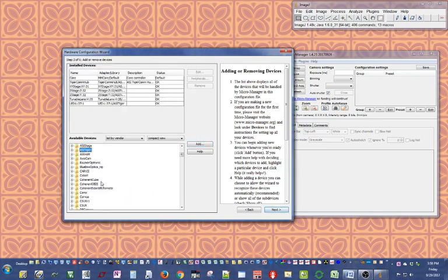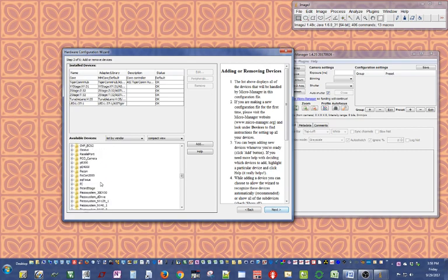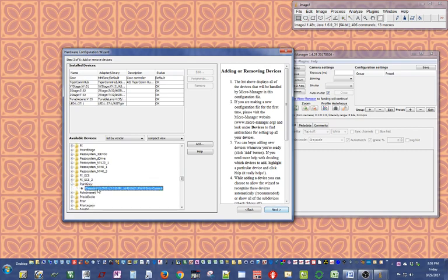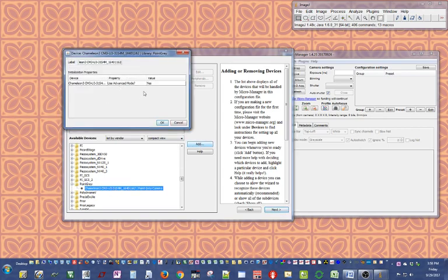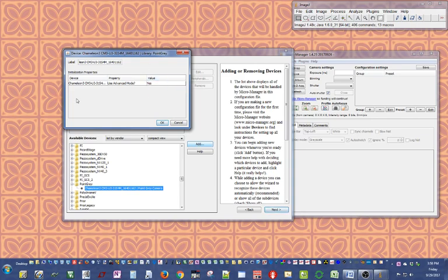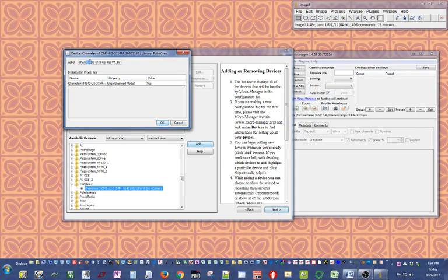Next I need a camera. Like I mentioned before, I have a Point Grey camera. Scroll down here to find Point Grey. Chameleon 3 - it's already connected to the camera and it's here. I just need to add it to the wizard. I'm gonna pick advanced mode. This is only relevant for the Point Grey cameras. The label for this camera is really long and I don't personally prefer it, so I'm just going to reduce it to something smaller.